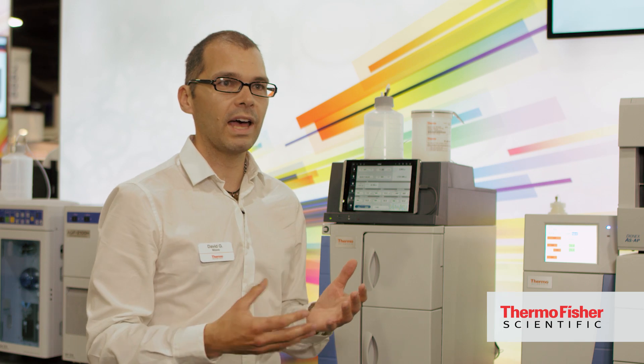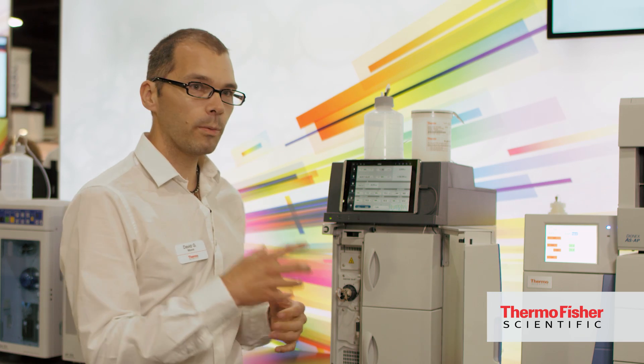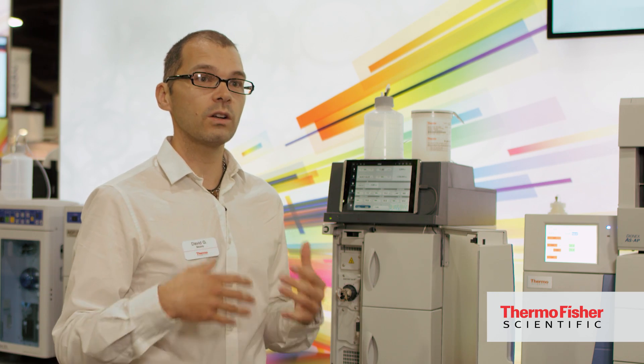It's very easy to see which parts go where, which consumables go where. If you have an issue, you can easily identify where it's occurring and repair it. What we've incorporated onto this system is a technology that was developed with the HPLC team.